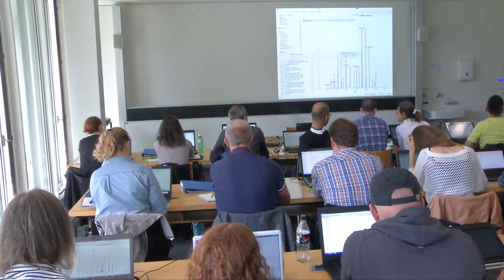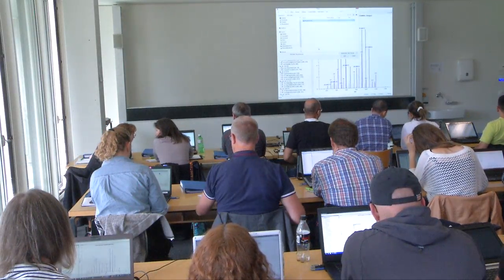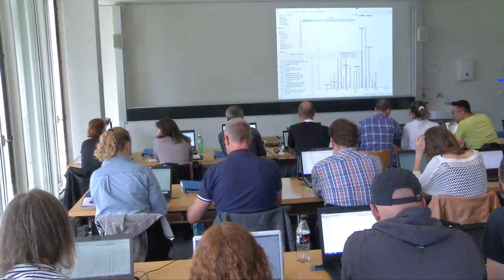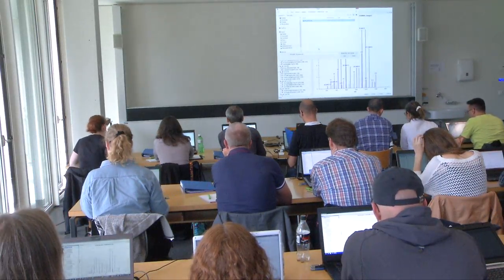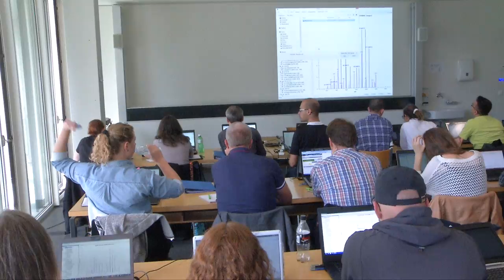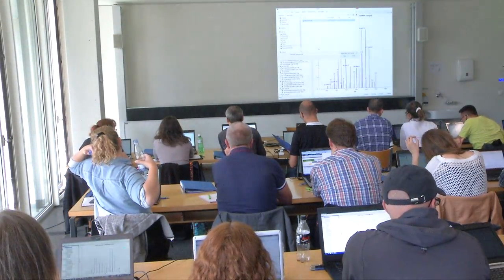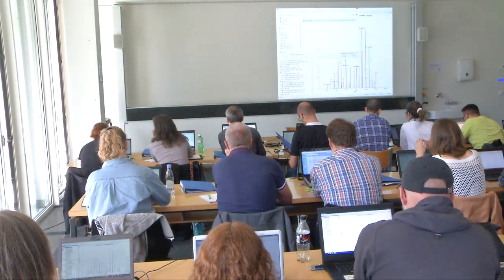Yeah, I think that's not it. So go down to heart failure. Go to raw. Go to Skyline. Okay, click open and desktop.